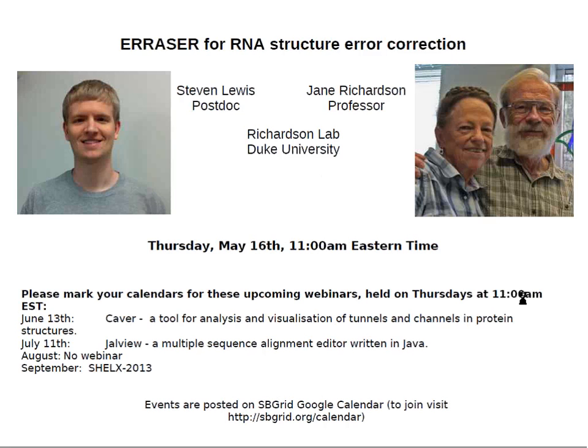I had a couple of questions, and maybe you can touch on these in relation to RNA structures that also have protein. It would seem at some point you could re-refine all known RNA structures, because this seems universally applicable to those. Is it something you've done or something you have plans to do?